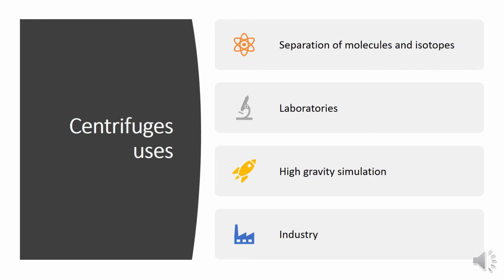Fourth, industry. It is used to separate components such as separating cream and butter from milk, and in chemical preparation.